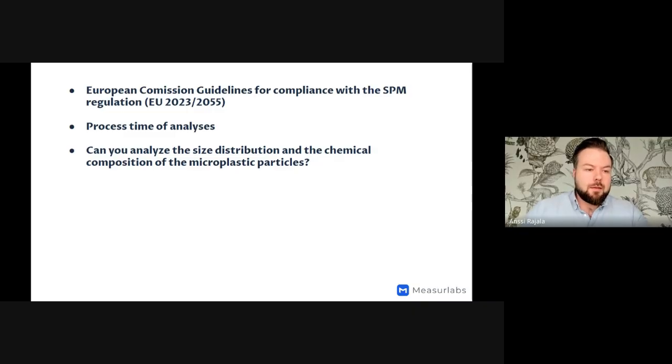And then, can we analyze the size distribution and the chemical composition of the microplastics particles? And yes, this is possible with the microspectroscopic methods.